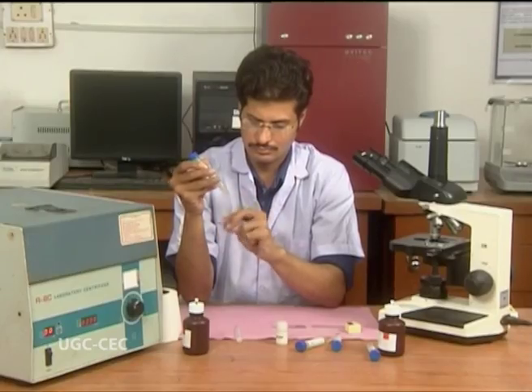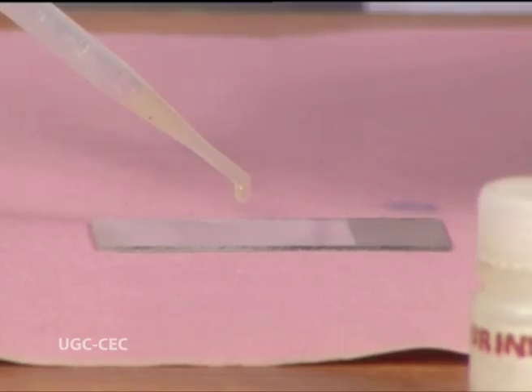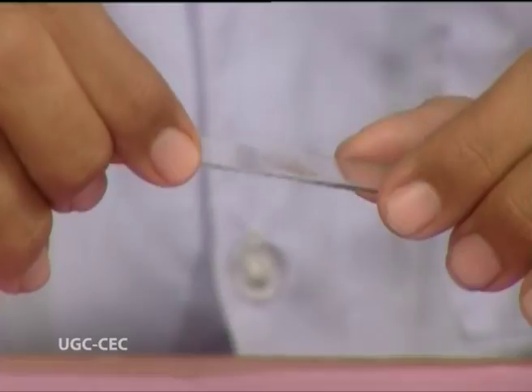The sediment is resuspended in the remaining supernatant by flicking the bottom of the tube several times. A drop of resuspended sediment is poured onto a glass slide.